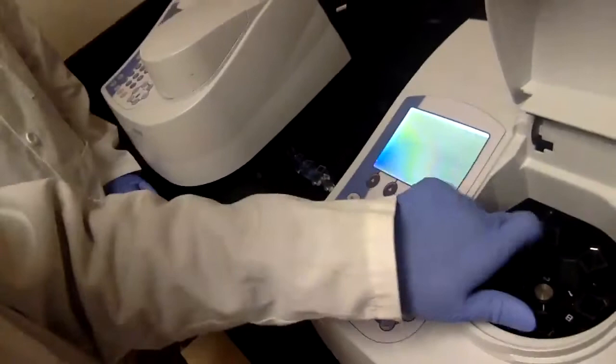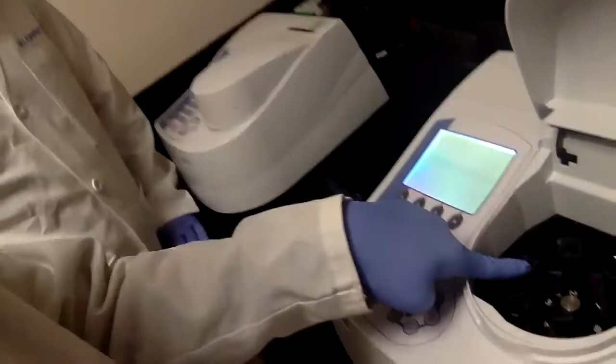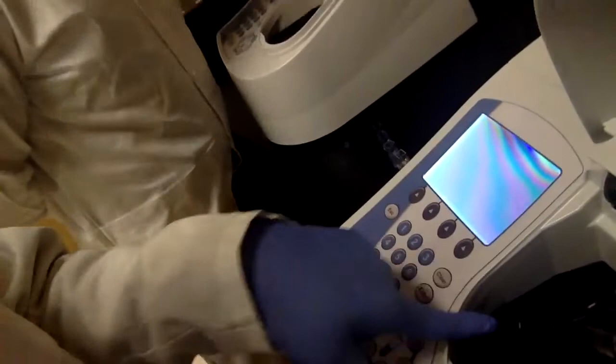If you look at this part here, this will be the light source. That will generate light, and the light will come from here and go here. So at this position will be the one sample that will be measured. Which position? This one.